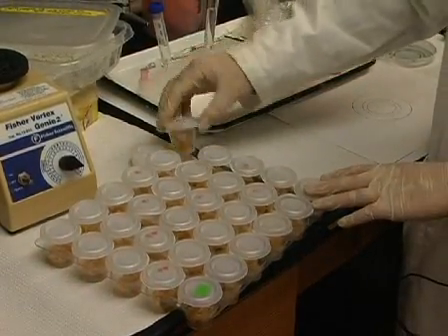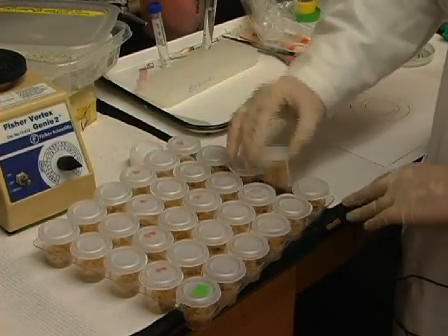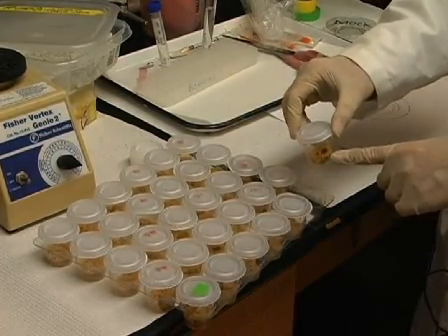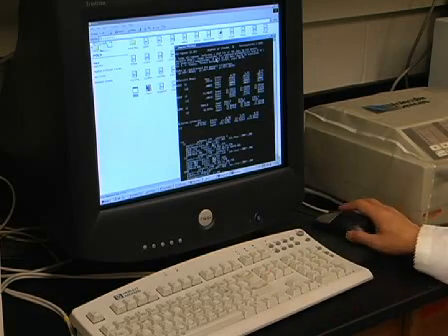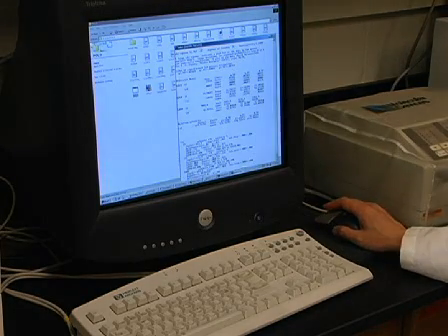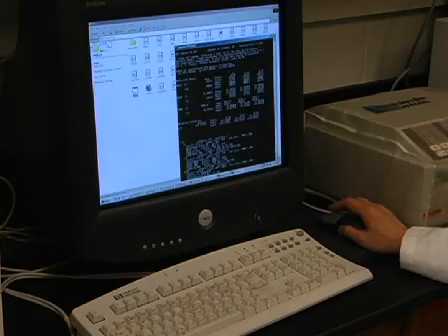In this case, larval mortality is scored every 4 to 8 hours, with more frequent observations if the rate of mortality is high. Survival time bioassays are performed using an LC99 dose of virus. Median survival times and the 95% confidence limits are calculated using the Kaplan-Meier estimator using an S+ or SAS program.